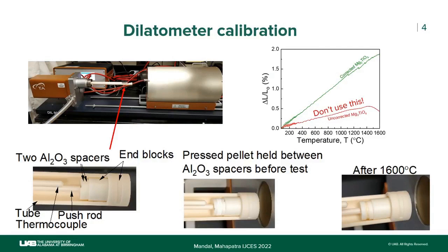So this test is just focusing on the raw material itself. If you get the same 5% shrinkage for the premium raw material versus your new raw material, then you can realize, okay, our raw materials are on the same page. So now we can make some final compositions and test them. But if you just throw your raw material into the big formulation, it has microsilica in it, it's fumed silica, you don't know what it is reacting with.